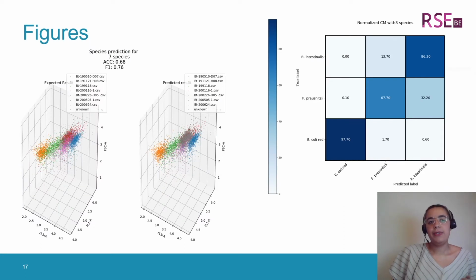We also produce these figures. The 3D graph compares the expected results to the predicted results. It is produced for the testing part, the tool analysis function, and the prediction function. The user can manipulate the 3D graph to obtain the best angle where the clouds are distinguishable and can also choose the axis. It also shows the accuracy when we know what to expect.